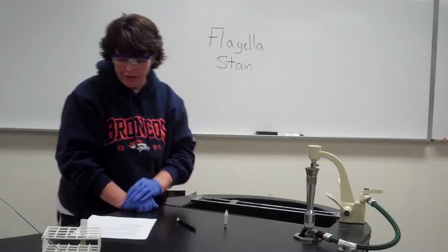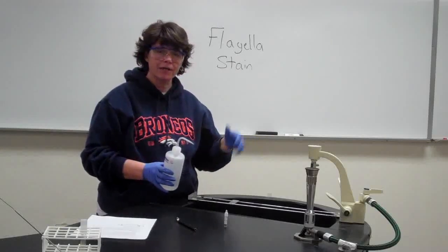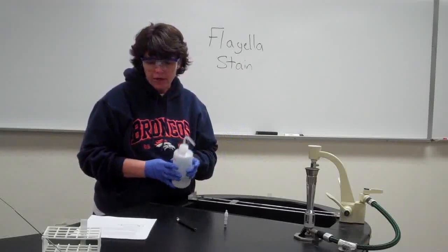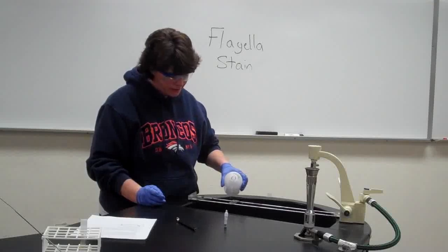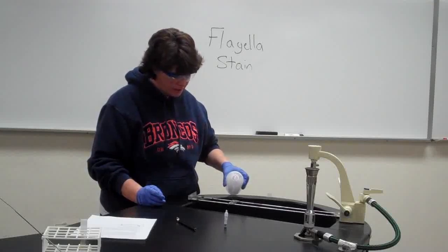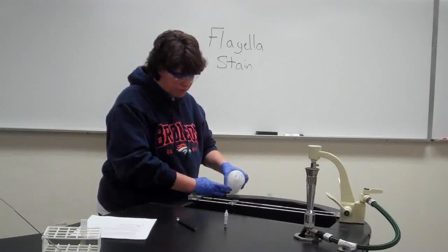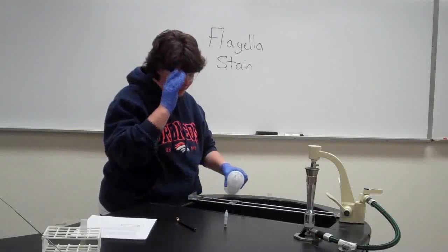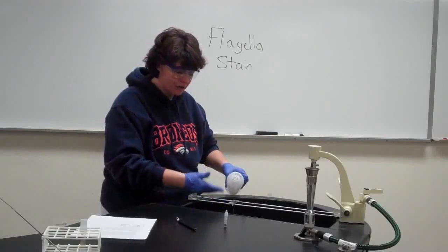To rinse, instead of holding the slide up and rinsing like we're used to — which would break the fragile flagella — you're going to run water directly on the slide and allow it to just run off. The stain would be purple when you're doing it. Keep spraying water on the slide and the water will drip off the edge. Continue until the majority of the excess stain runs off with the water.